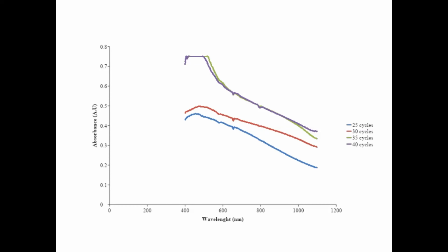Then look at the graph of absorbance against wavelength for sodium hydroxide as a complexing agent. You can see the absorbance decreases with increase in wavelength.